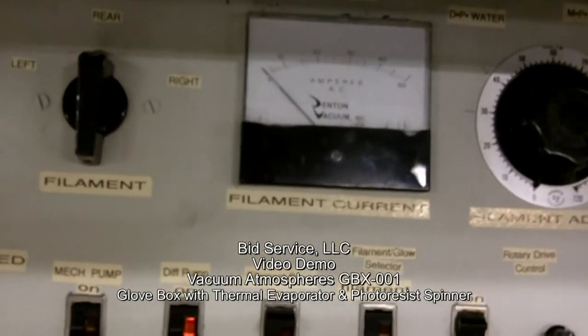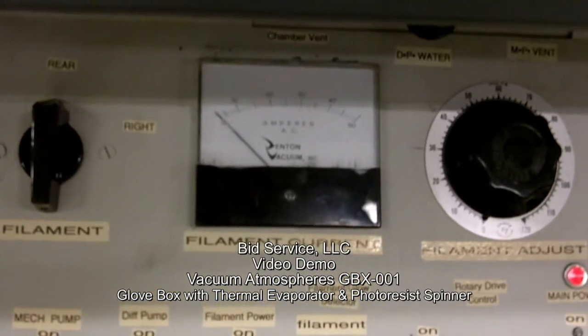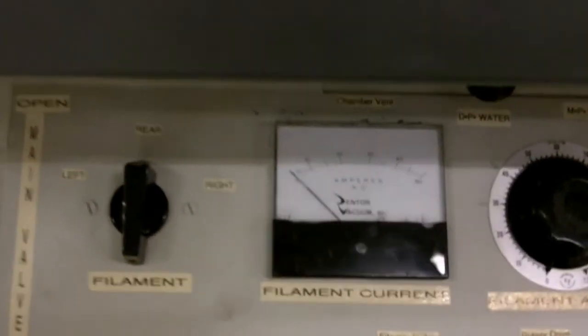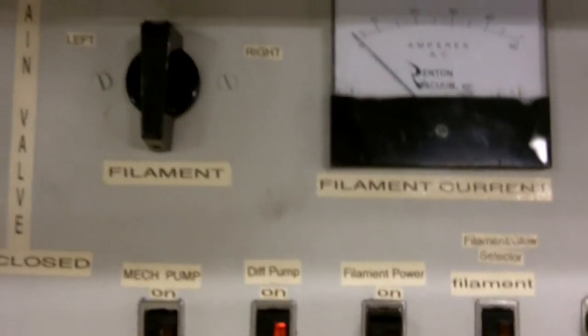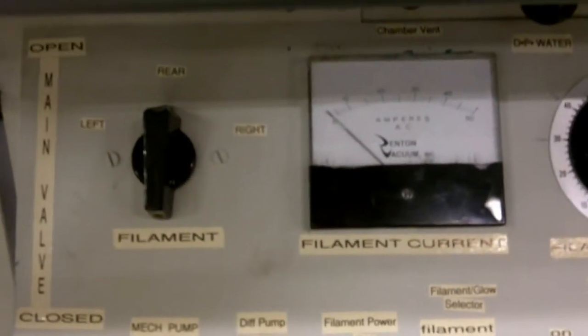We have here a DV502 which is installed on the vacuum atmospheres glove box, which I am now demoing. We will do an example of the evaporations with the left, rear, and right filament, and just a couple of controls.